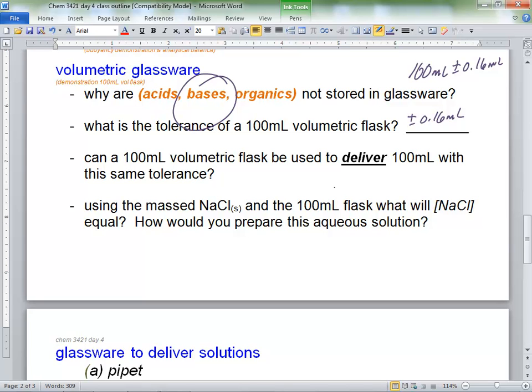Someone did the study. Sodium chloride was in there. Let's assume it's all dissolved at the bottom. Just pretend it is, it's not yet, but pretend it dissolved really easy. How many times do you have to invert this to actually mix the solution? Someone did the study. It's 12.